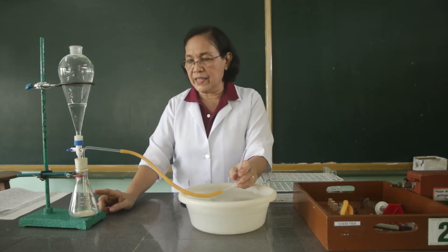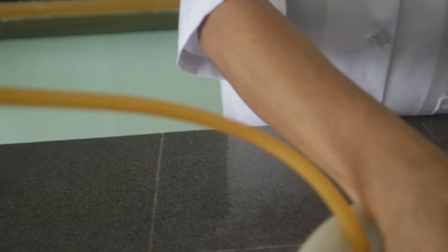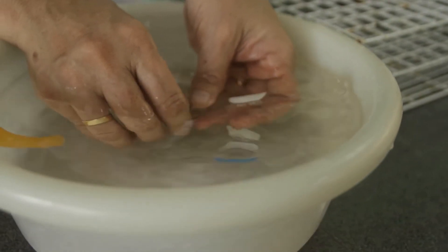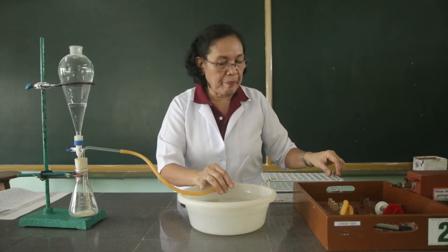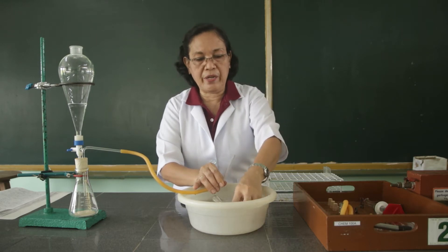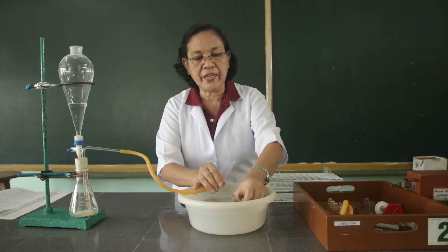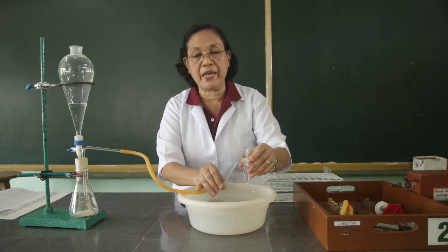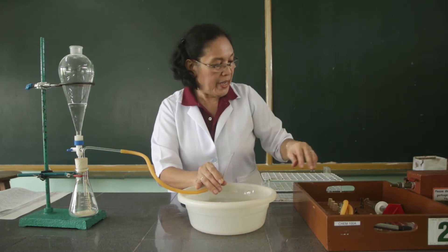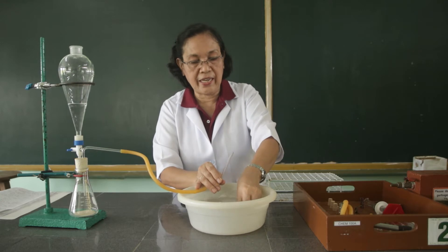The acetylene gas that will be issued out passing through this delivery tube will be collected by using the water displacement method. I am going to prepare test tubes and fill them with water so that the water inside will be displaced by the acetylene gas. We are going to collect five test tubes of acetylene gas.